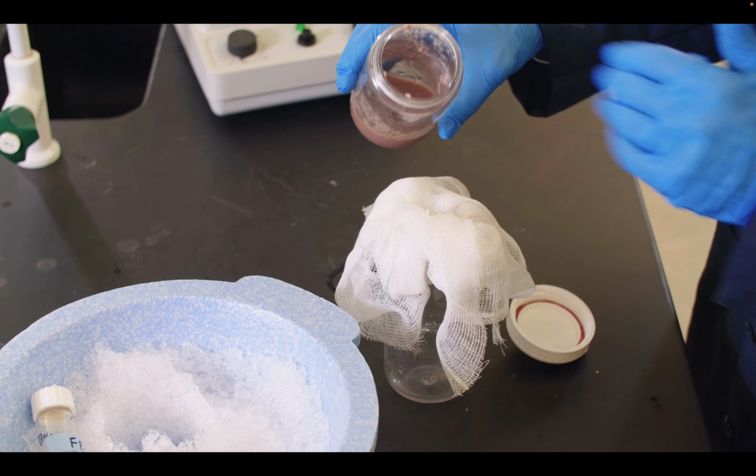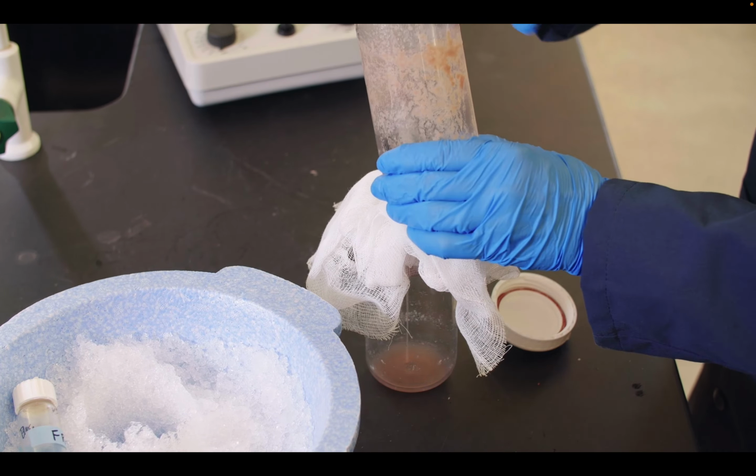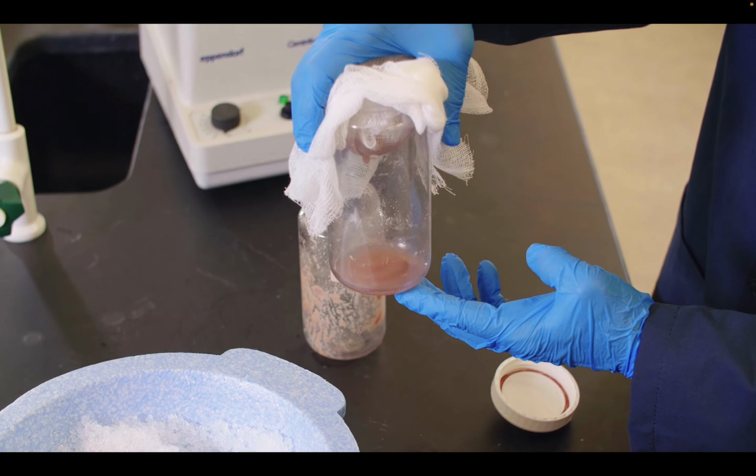And we're just going to pour this fraction that we've heated to denature a lot of other enzymes, and we're going to pour through here. And it's effectively just going to be a really simple filter. Simple but effective. It's kind of low tech, but it is actually highly effective, and we don't need filter paper or anything else like that. And you can just see it dripping straight through.